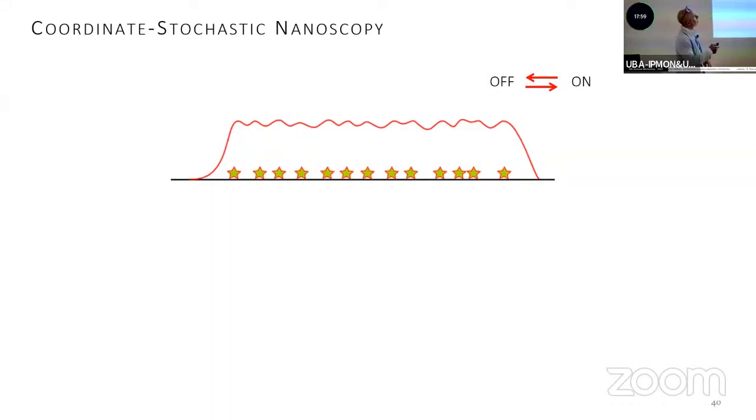So imagine you have, again, fluorescent labels organized in some way, and the distance between them is smaller than the diffraction limit. So if you would register the fluorescence of these labels, if they are all emitting at the same time, you will see something like that. There's no way to tell where each label is, right? So, but now let's imagine again that we have a way to switch molecules on and off. But in this case, randomly. This could be done chemically, physically, we will see later, photochemically.